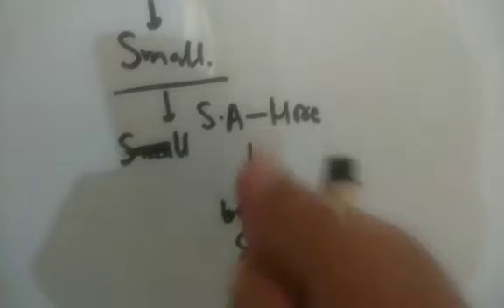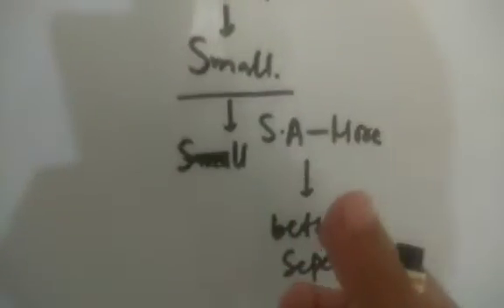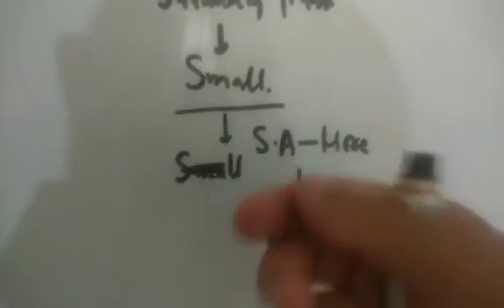So because of high pressure, it's a fast process, quick time. Because of the fine size particles of the stationary phase, it gets more surface area, there are more interactions with the components, that's a better separation. Number two, so that's why ये दो main points हैं as far as the stationary phase and mobile phase are concerned in the HPLC compared to the other chromatography techniques.